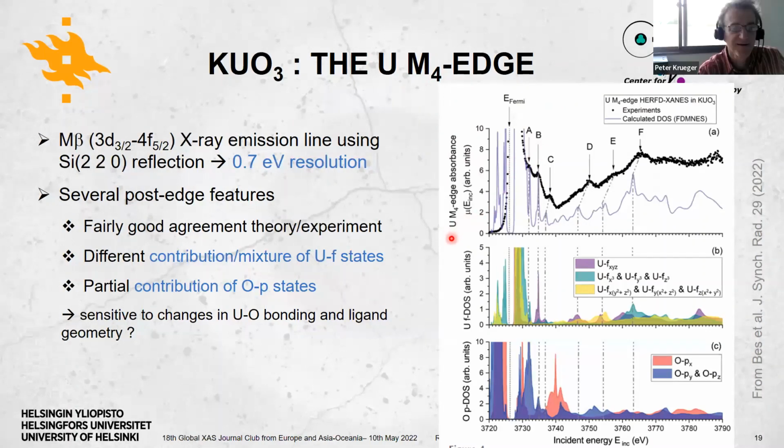Okay, Peter. Hi. I'd like to make a comment about question one before about the peak positions. In my experience, I think it's quite normal that you can have upshift. I mean, that the experimental peaks are higher than the theoretical peaks in higher energy because the reason would be that the exchange correlation potential that is used here for a ground state calculation is not so well adapted for higher energy states, and you have kind of optical potential effects. I think this is rather common.